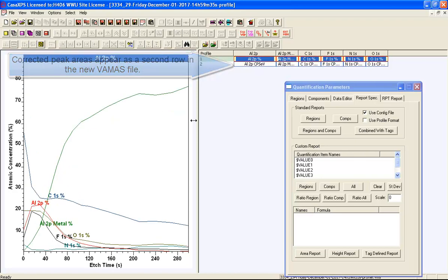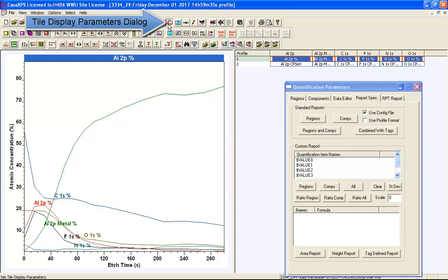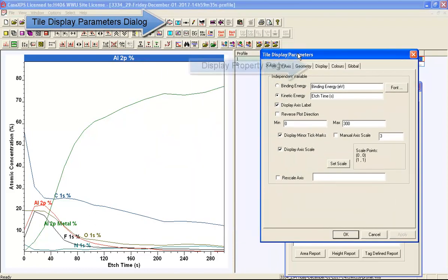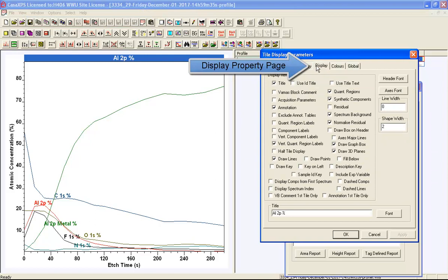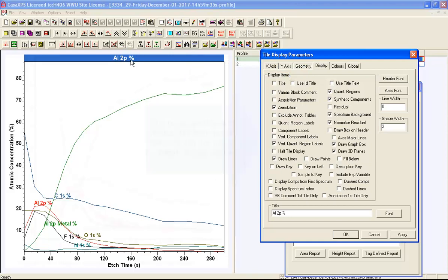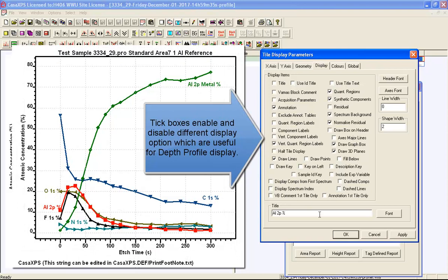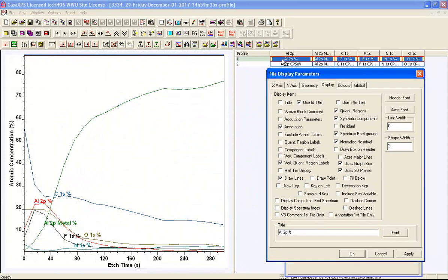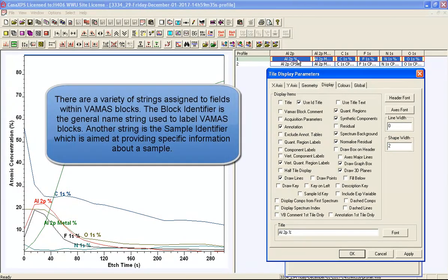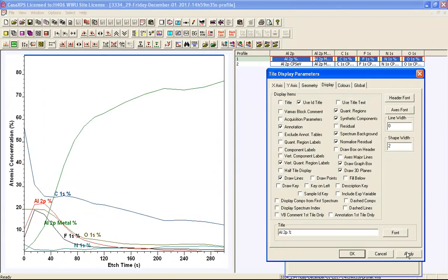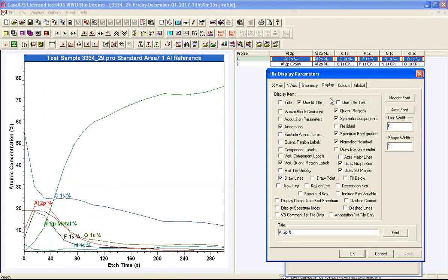The display of these traces is managed by various options in the tile display parameters dialog window. On the display property page, you can turn off the title — currently the profile title is taken from the first VAMAS block, which is 'aluminium 2p percent.' You can also replace the VAMAS block name with the sample identifier assigned to these data as the title, which is what 'use ID' means. The title then derives from the sample ID from the VAMAS blocks.